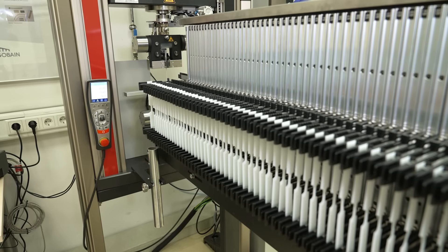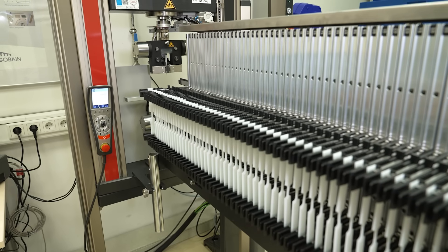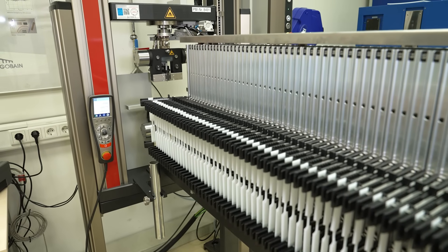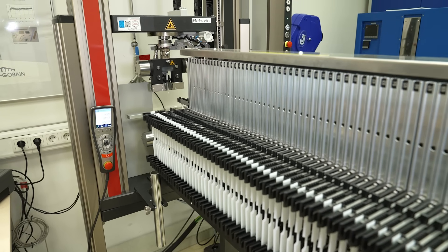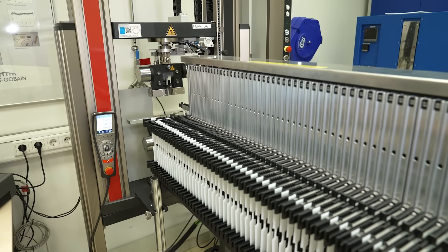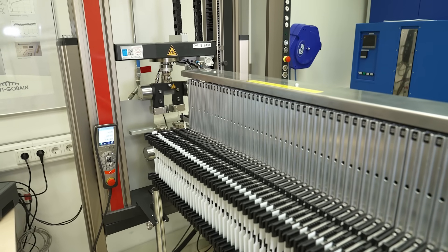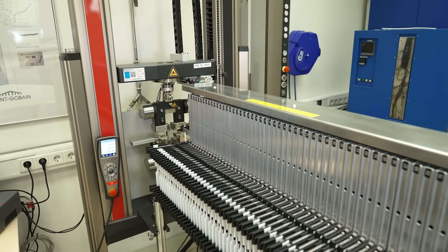The quality of the material is tested here, so important for our customers is the tensile value as well as the elongation value of the material. Therefore, we need to test our products during serious production, and due to the fact that we have a lot of samples, we can test here overnight. That's a big advantage of this machine.